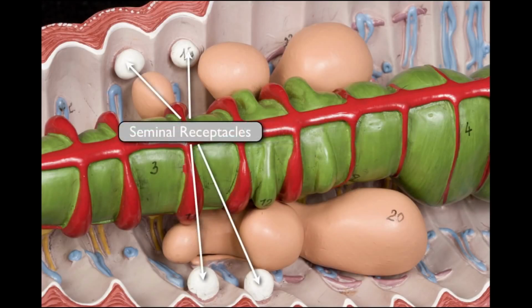The 4 seminal receptacles are part of the female reproductive system. During copulation, the earthworm receives sperm from the other worm, which is stored in the seminal receptacles. Fertilization in earthworms is external. Once copulation is complete, the earthworm will secrete a mucus sheath that covers the genital openings. The worm then releases its own eggs and the sperm that it received from the other worm into this mucus sheath.